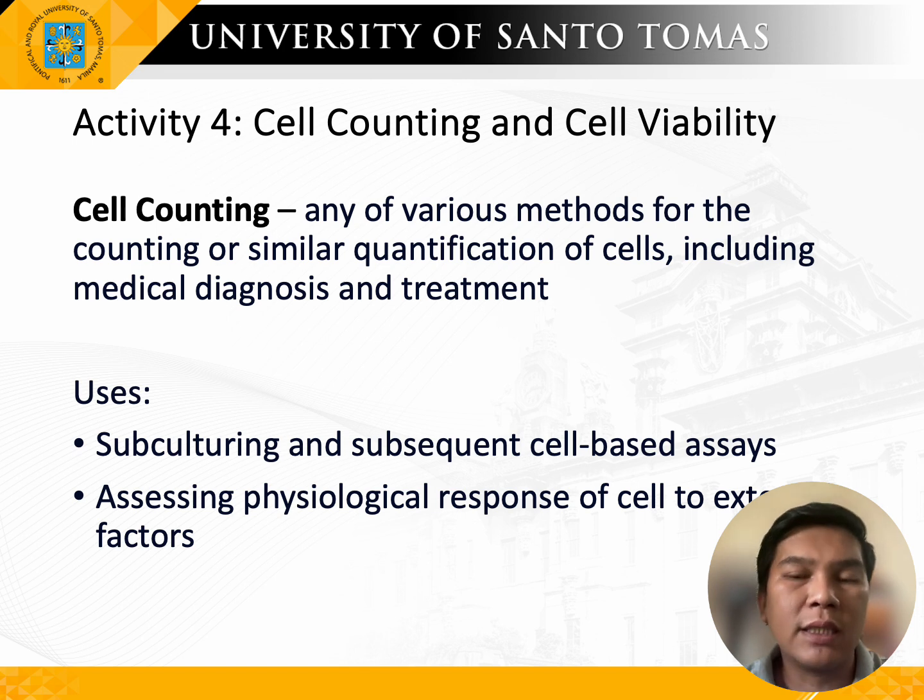This process is actually used in both medical and research laboratories in subculturing and subsequent cell-based assays, especially if you are going to perform serial dilution, for example, and at the same time assessing the physiological response of cells to external factors.